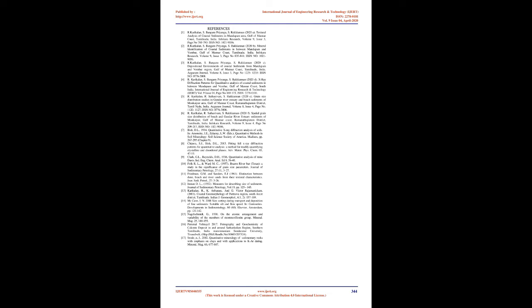5. Discussion. The study region is underlain by recent sediments followed by the Cuddalore Sandstone Formation. It is a chief source of quartz. The Gundar River Estuary sample XRD mineralogy results show a predominance of quartz, mica, feldspars, sillimanite, hornblende, actinolite, kyanite, and biotite. The following minerals indicate source rocks of granitoid gneisses, MgAl granulites, and hornblende biotite gneiss derived from the Southern Western Ghats and Udayagiri Hill ranges and beach sandstone. Some beach samples show garnet, ilmenite, and magnetite in raised beaches with sandbars parallel to the present coastline, light minerals being removed by winnowing of waves.